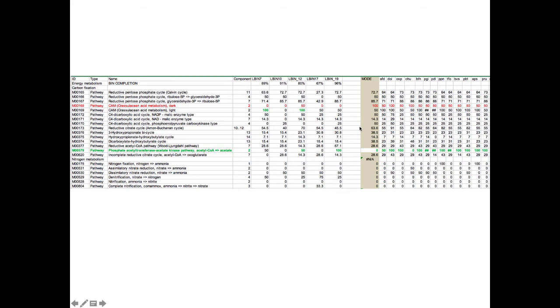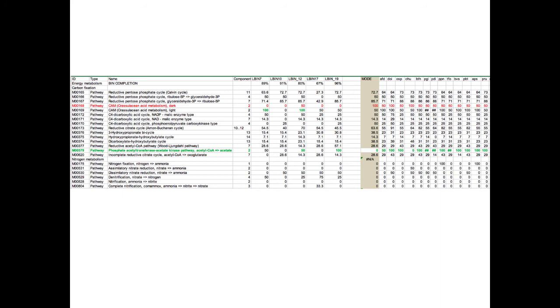MAPLE additionally allows you to upload the most closely related reference genomes in the same analysis, or pull from ones already uploaded. You get a table comparing, for example, five Bacteroidetes bins from a leachate metagenome at different levels of completion, alongside reference genomes from within the Bacteroidetes. You can highlight pathways that are essentially universally present in the Bacteroidetes but canonically absent from your bins, or unexpected pathways present in your bins. For instance, a relatively incomplete genome had 75% of a denitrification module — unexpected for Bacteroidetes, which never have it. This tool lets you see in a single glance what distinguishes your organisms, what they have that is expected, and what they have that is not expected. It's only as good as your references, though — if you're in candidate phylum territory with no good reference genomes, your best match won't tell you much.